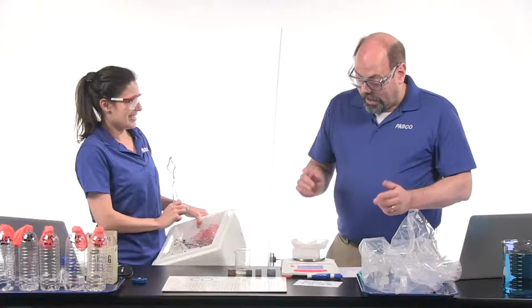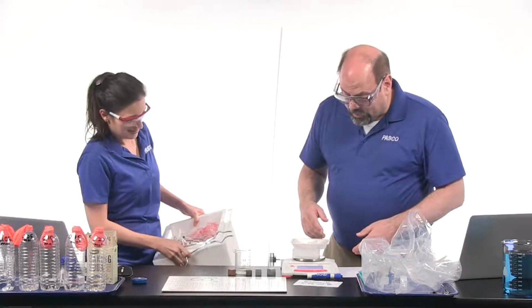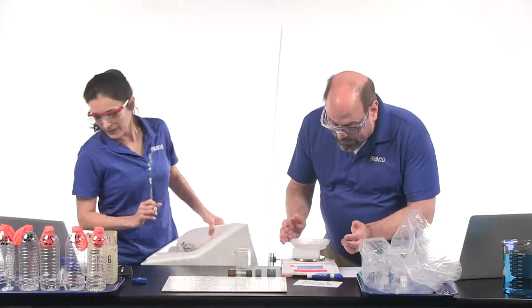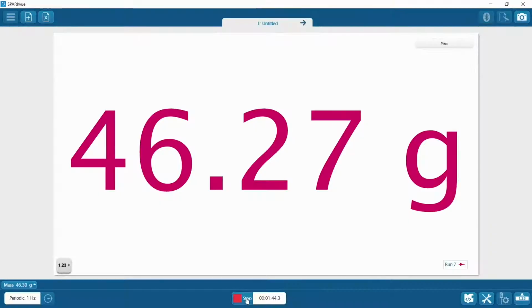We call that, yeah, that's sublimation. Sublimation is phase change from solid to gas. And we'll get a chance to see some other kind of phase change as well. We're really close to being right on what we need, maybe a little less. But that would give you a really good idea of how much is in here. So we got a little more than a mole of CO2 there.